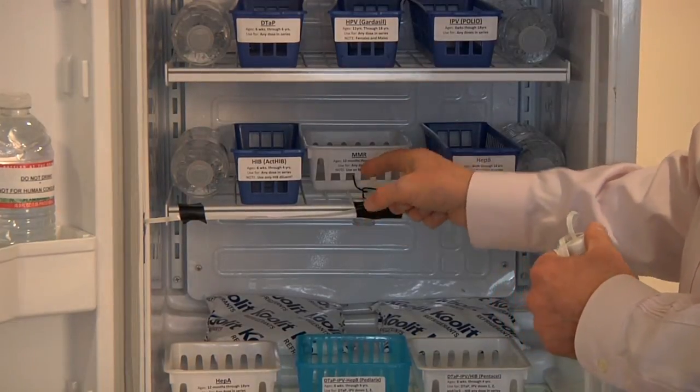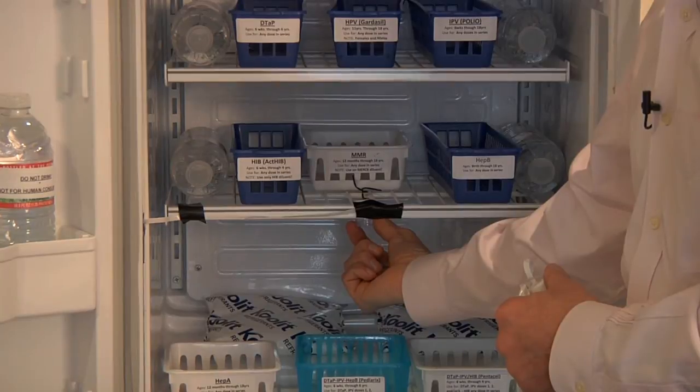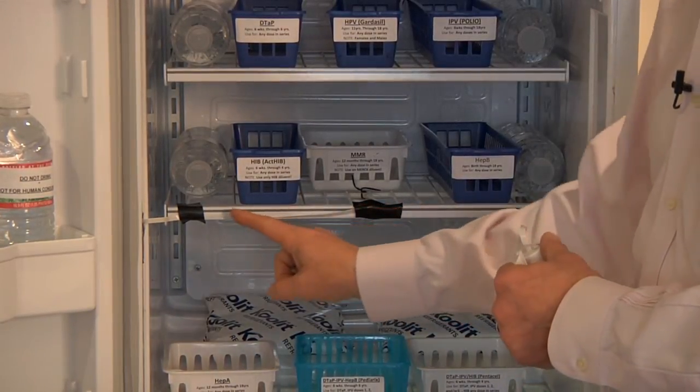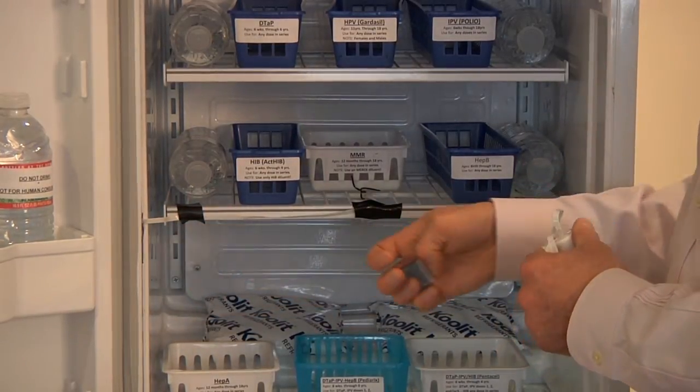This wire rack allows for hanging the external probe from the exact center. Tape is used to secure the probe in order to keep it out of the way for daily use.